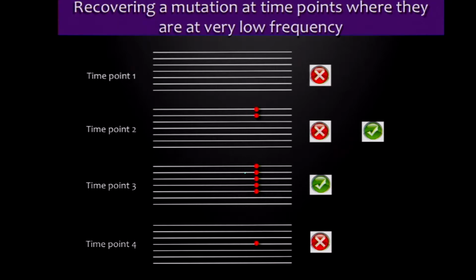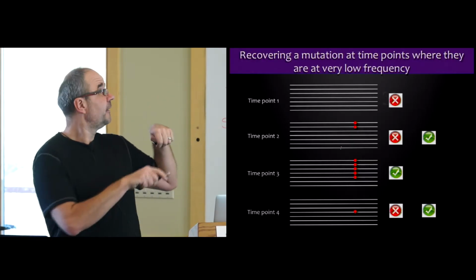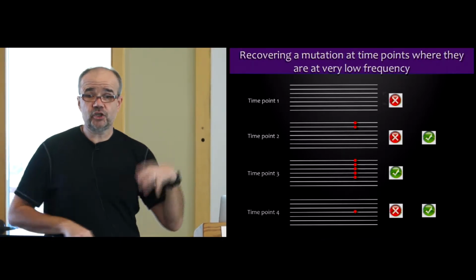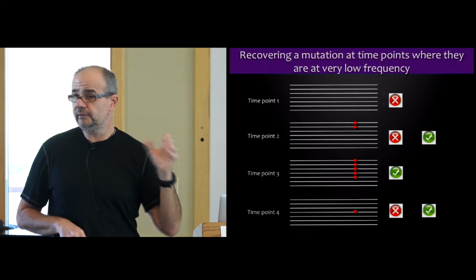Because I see this variant here, the likelihood that what I saw here is a signal rather than sequencing error is higher, so I can now say that this variant was already present at this time point and hasn't completely gone away after the next course of therapy. In separation it would be difficult, because the signal to noise is not going to go away. But this is a way to bootstrap calling at this position from information gained at another time point.